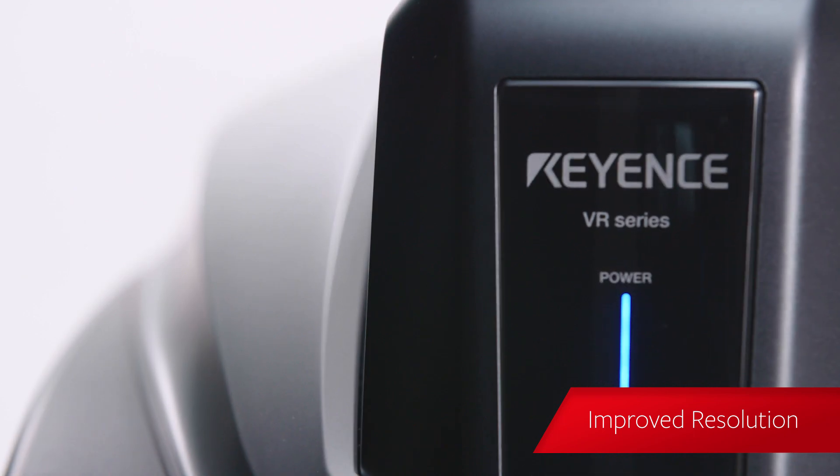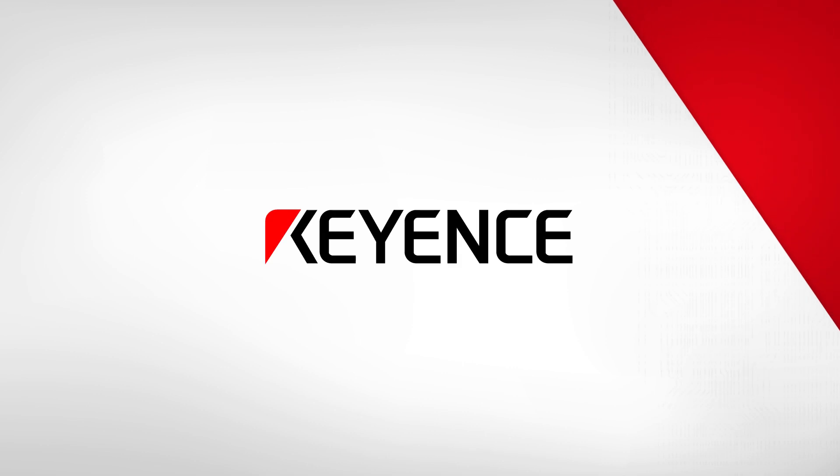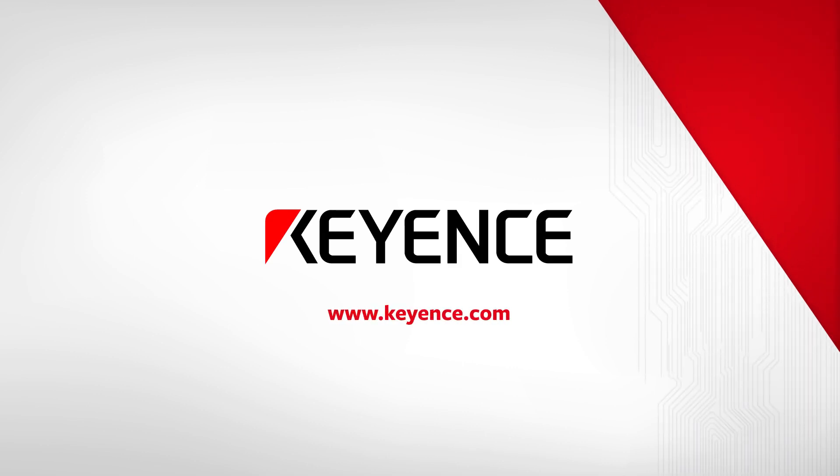Improved resolution enables surface roughness to be measured on non-uniform surfaces. Visit our website to download the product brochure or contact us directly for an on-site product demonstration.